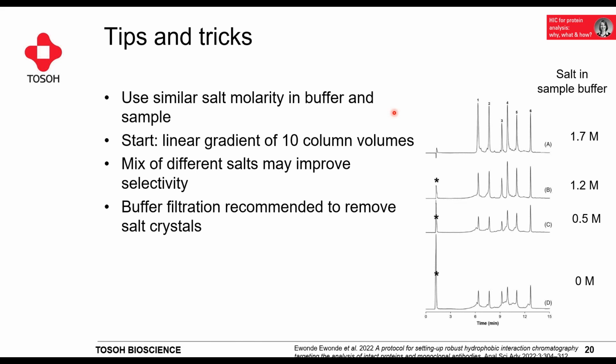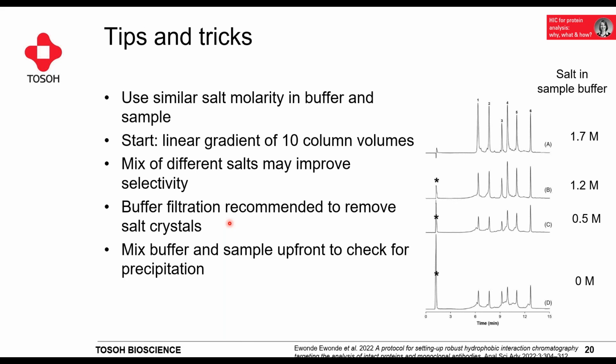Now, due to the fact that we have a lot of salt in our buffer, especially in the A buffer, so the buffer for binding, it is recommended to filter the buffer before you attach it to the HPLC system, just to remove any salt crystals.